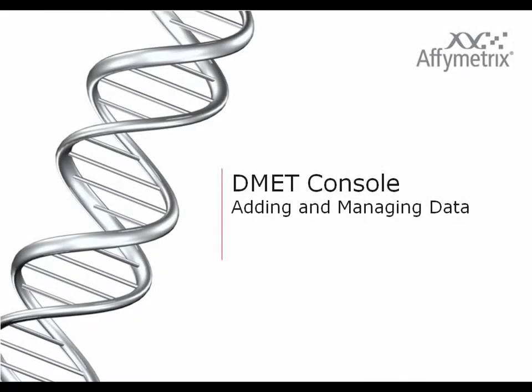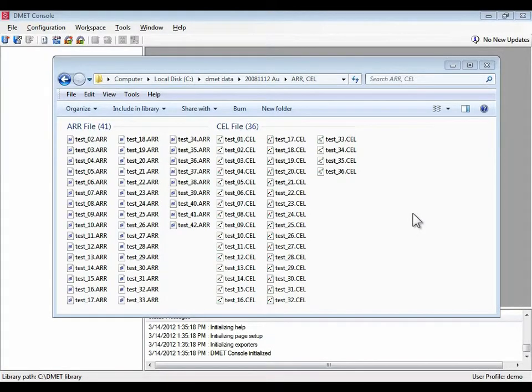This section on DMET Console software covers adding and managing data. Let's begin working with DMET Console by importing some data.